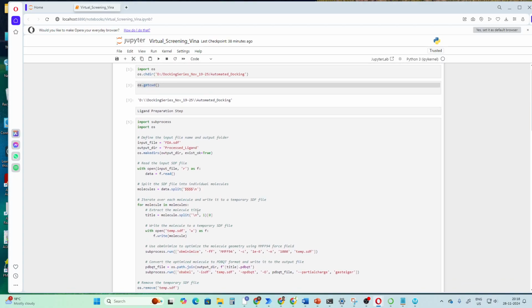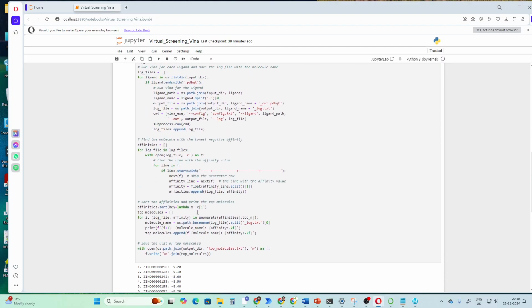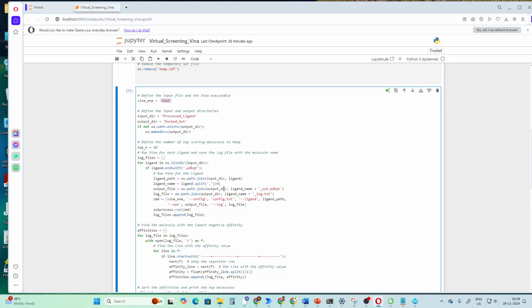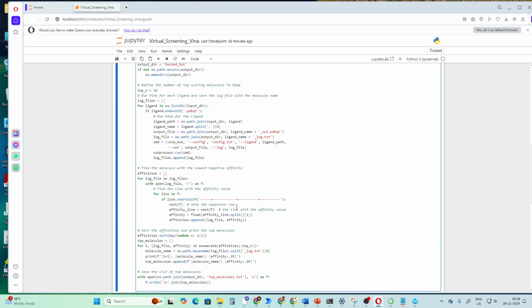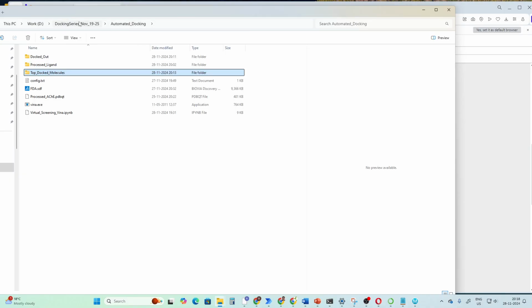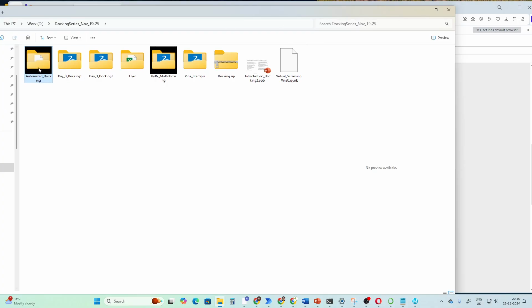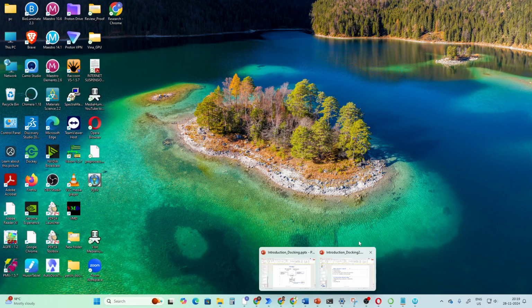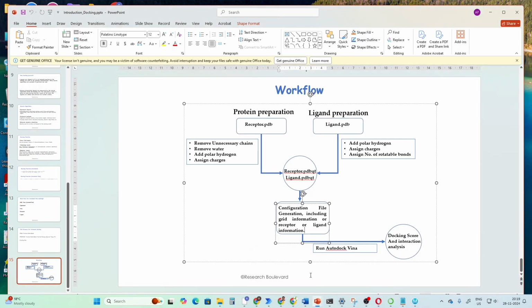and the most important thing, where I've seen that all our students make mistakes, is when you are not keeping the configuration file in the same folder, and also the vina.exe file and the prepared ligand. Okay, those are the important things. Anyway, I will be sharing this particular folder, so you can look it up in this folder, and also you can use this folder to repeat the docking again. Anyway, so let me come back to our next step.